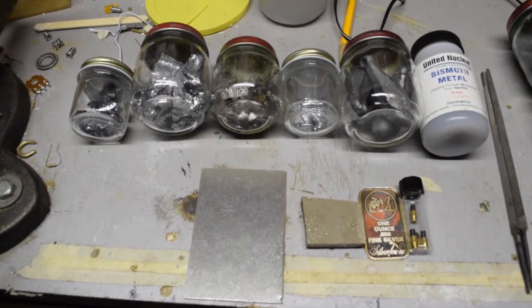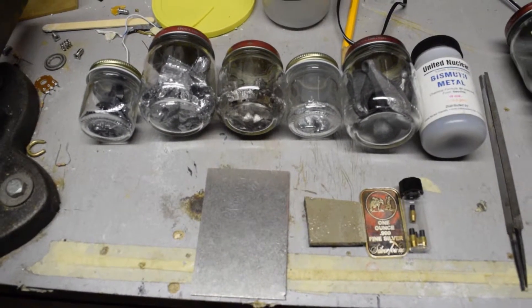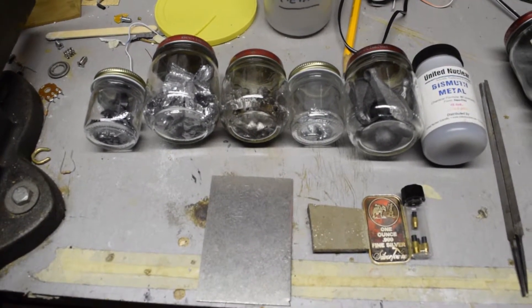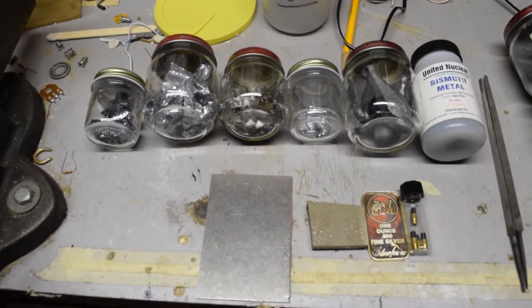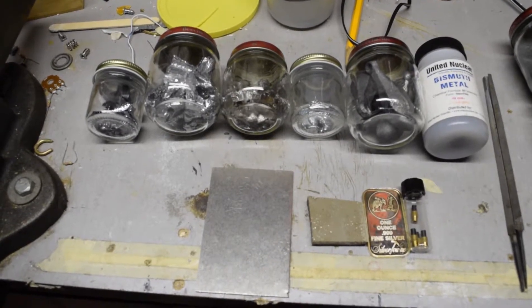Hello. In this video, I'm going to be doing flame and flammability tests of different metal powders. These tests are going to show how the metal reacts to fire, if it sparks, if it burns, if it's non-responsive.